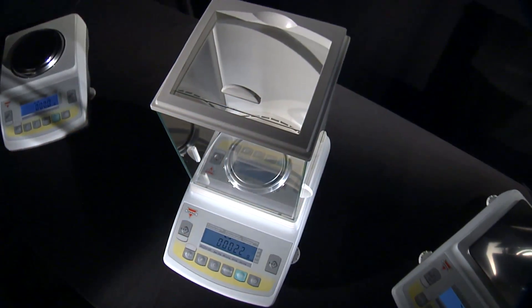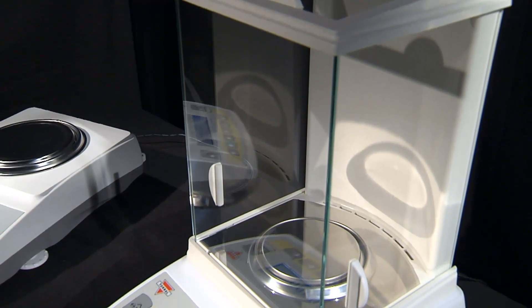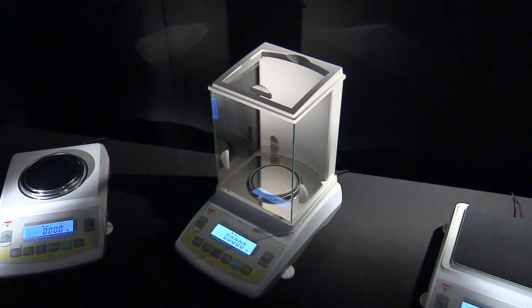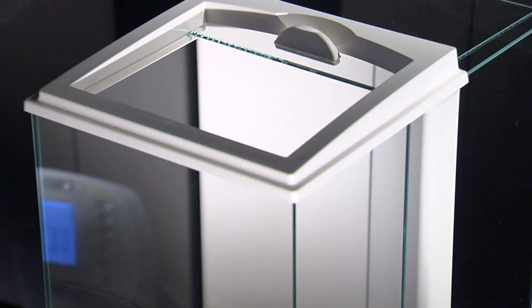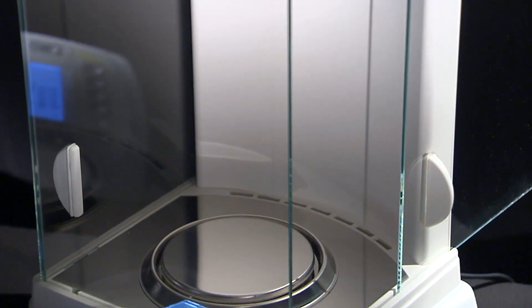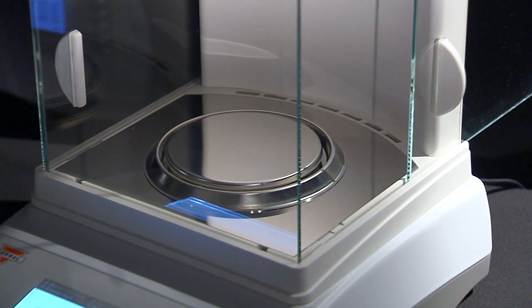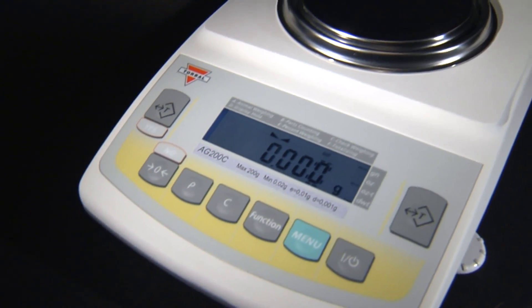The AGC analytical balance is equipped with a large weighing chamber measuring 9 inches in height and 6 inches in width. Both sides of the chamber as well as the top open to provide the user comfortable access to the weighing pan.